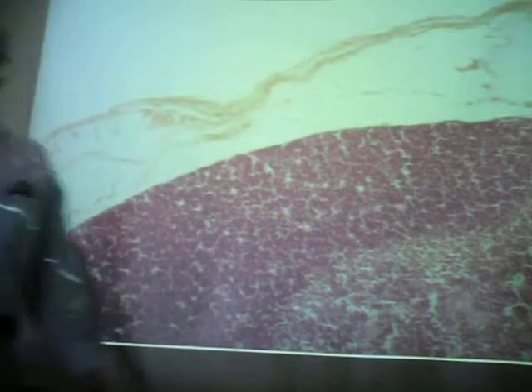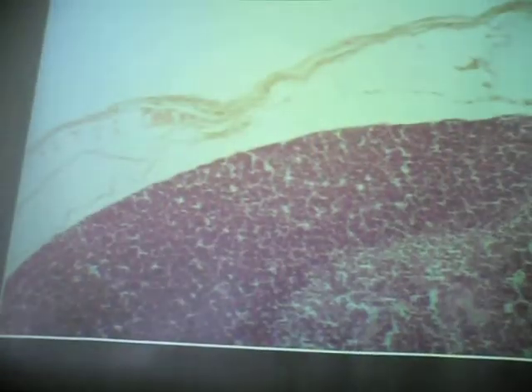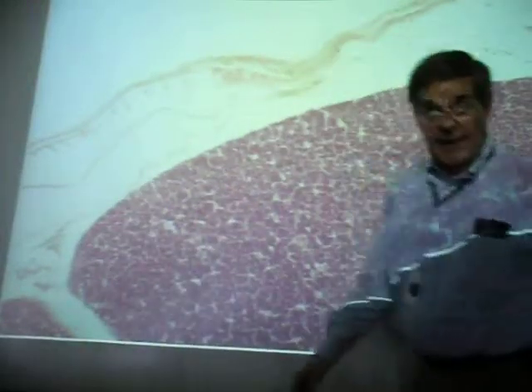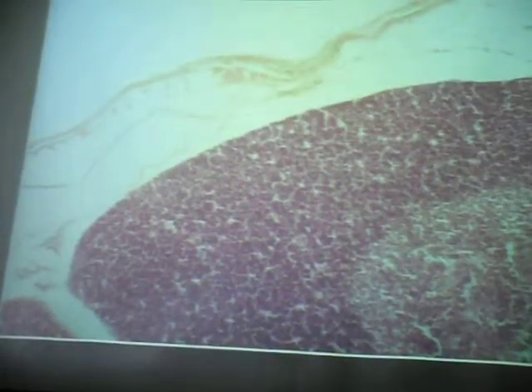Don't say college or finishing school. That's what it maybe amounts to. Now you've got something again surrounding the organ. We've seen it before, kind of torn away, but what is this? That's the capsule again, connective tissue that supports and protects the organ.